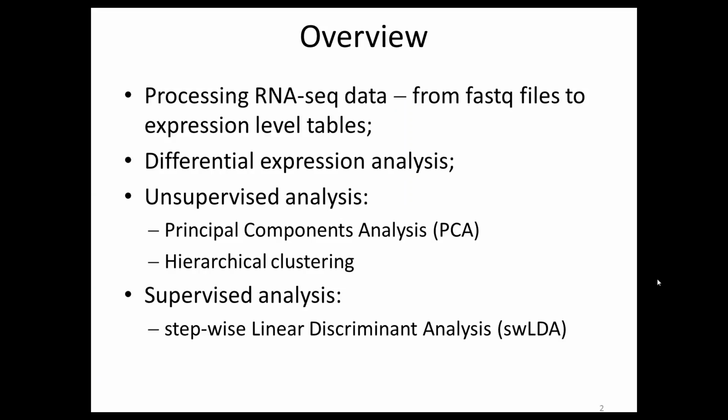Thank you. Yeah, great. Today we will discuss some approaches to the analysis of RNA-seq data. Here is what we will discuss. First, we will discuss questions of how to produce some expression level tables from raw FASTQ RNA-seq data. Then we will talk about differential expression analysis, and then we will talk about unsupervised analysis and supervised analysis for processing RNA-seq data.